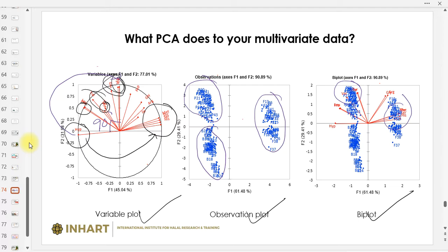For bovine, they don't have really dominant variables, amino acids, but they have low glycine and arginine, because these arginine and glycine are in the opposite direction of this bovine group. So if your gelatin has low glycine and arginine, that indicates it might belong to bovine gelatin. So this is how we explain it.